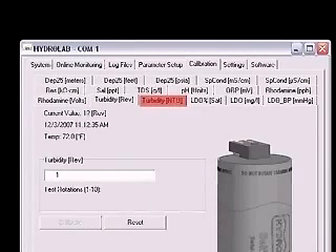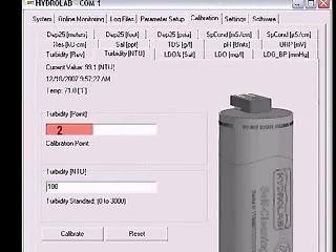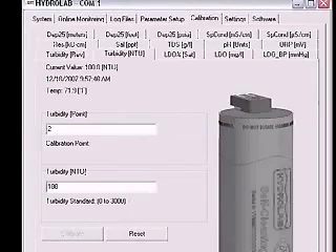Now click on the Turbidity NTU tab. In the box labeled Turbidity Point, enter 2. In the box labeled Turbidity NTU, type the labeled value of the standard. When the readings at the top of the page are stable, click Calibrate. Click the OK button in the Calibration Successful window. The self-cleaning turbidity sensor is now calibrated.